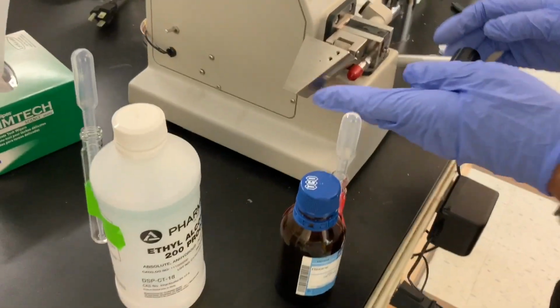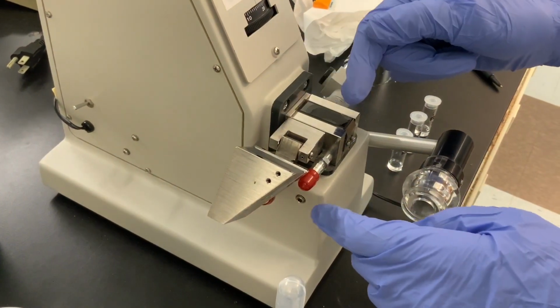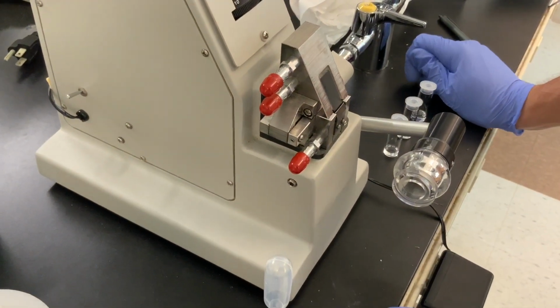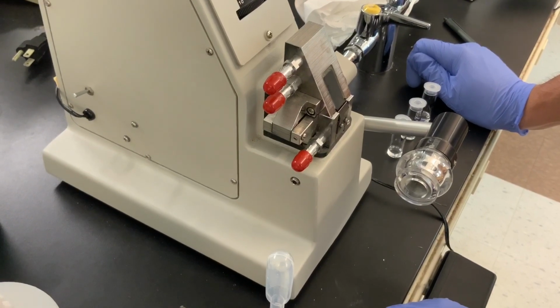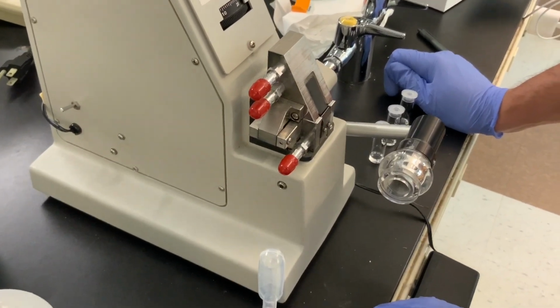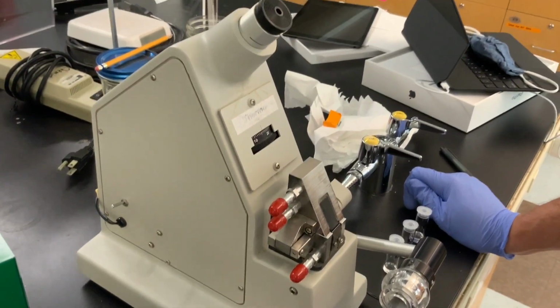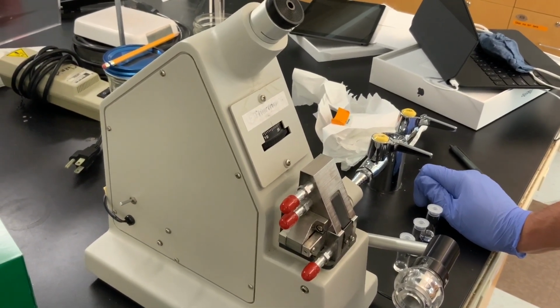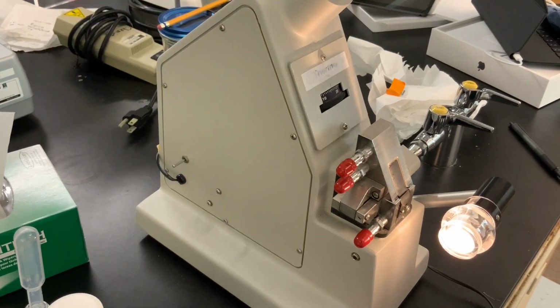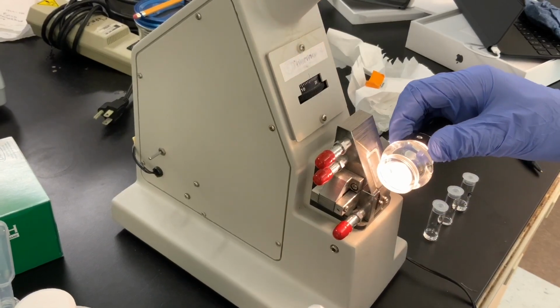Okay, so this is our refractometer. What we have here is where we're going to put the sample. And this is a prism that will have the sodium D light shine through our liquid, which is 589 nanometers, the wavelength that has been chosen historically to measure the refractive index. And so 589 nanometer wavelength of light is going to pass through the liquid from this lens, this light here, pass through the prism.